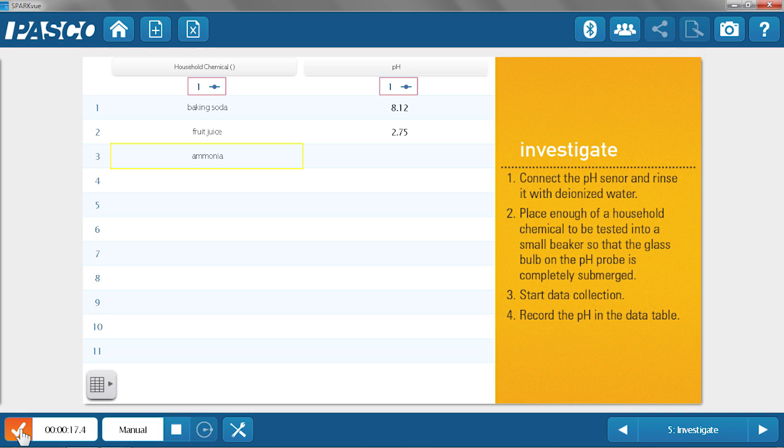I'm going to rinse it. And it's ready for the next. I'm placing it in the fruit juice. Now once he puts it in the fruit juice, I see that it's a much lower pH, indicating that it is acidic. And your students will be able to figure that out. Once it stabilizes again, I hit check.